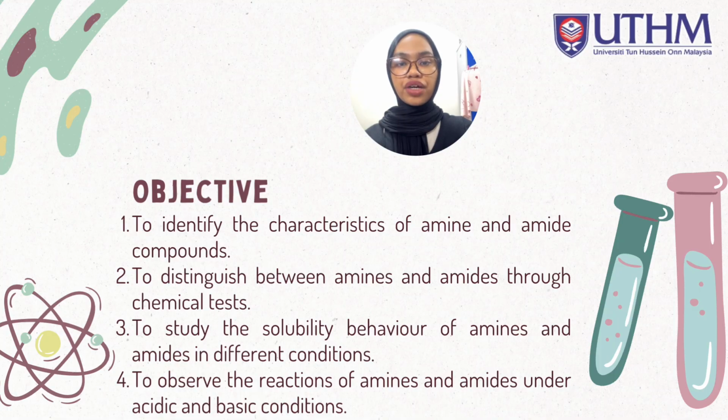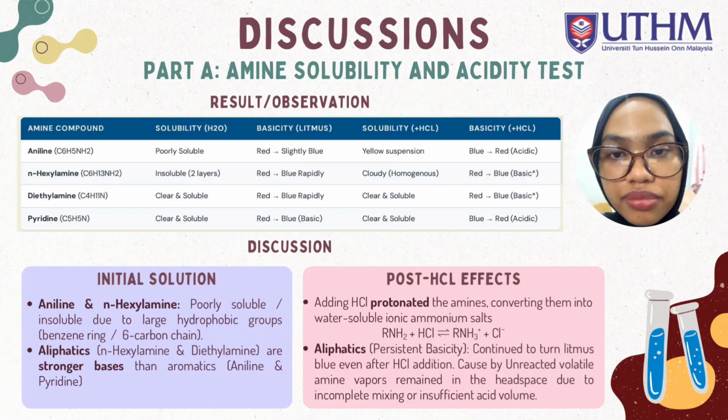First, to identify the characteristics of amine and amide compounds. Second, to distinguish between amines and amides through chemical tests. Third, to study the solubility behavior of amines and amides in different conditions. Fourth, to observe the reaction of amines and amides under acidic and basic conditions.